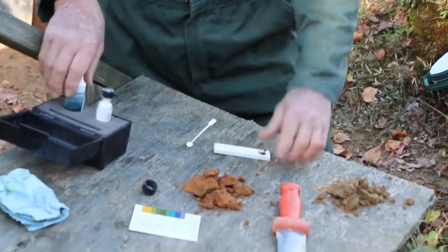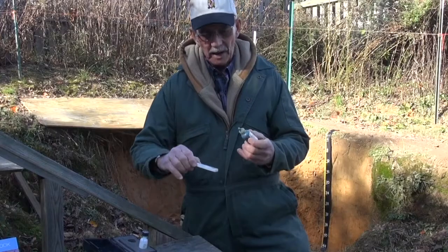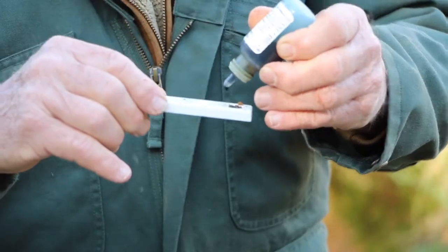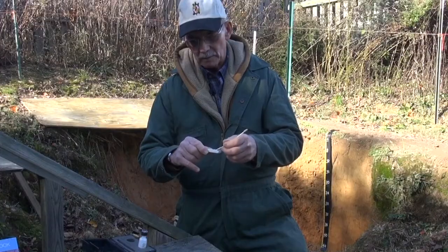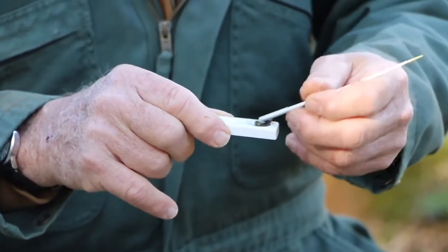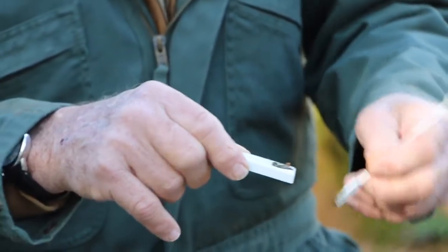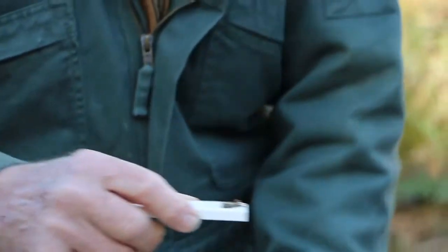We have two reagents here. Reagent N is a liquid, M is a powder. Drop about three to four drops on the soil. Work it a little bit — the ideal objective is to end up with a smooth, moist face with perhaps a little liquid moving into the corner.